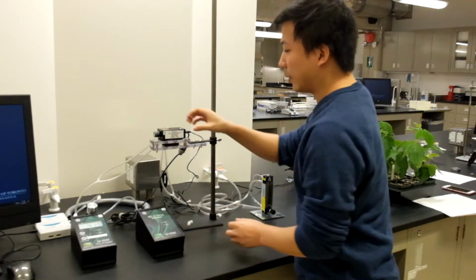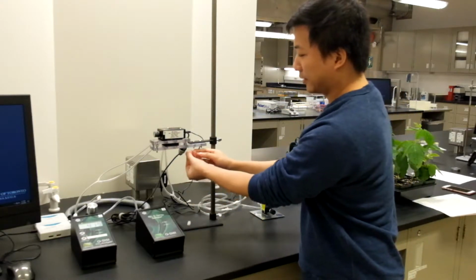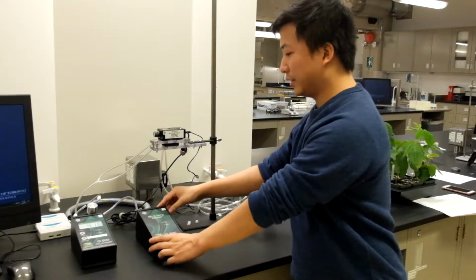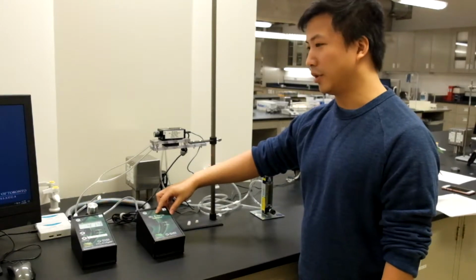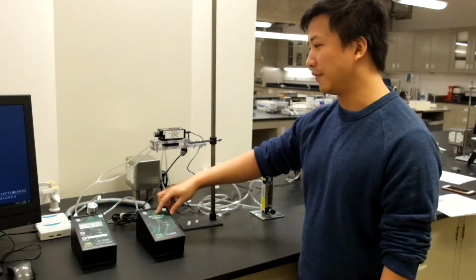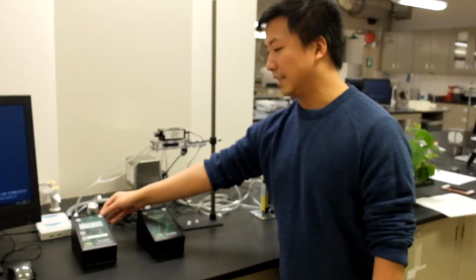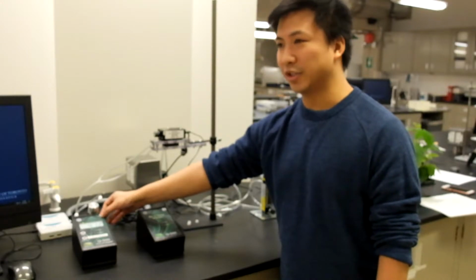To take a reference, we want to make sure that the chamber is empty, and then we want to seal it with these screws. Air will then flow out of the chamber into the relative humidity and temperature sensor, which allows the computer to record humidity and temperature of the air that's going through the system. And then the air will go through the CO2 analyzer for the CO2 concentration to be measured.